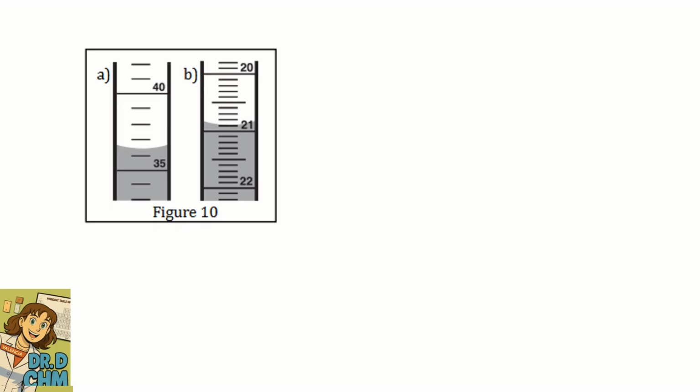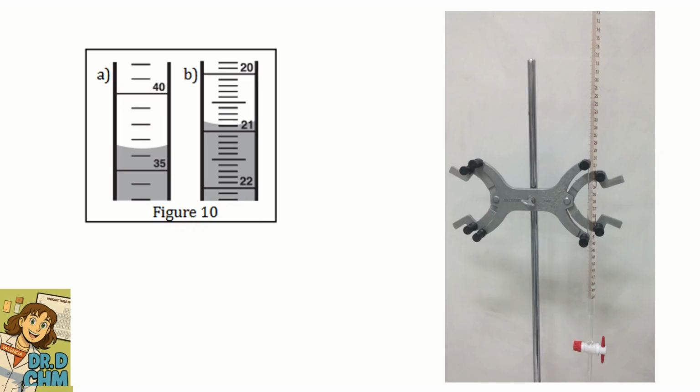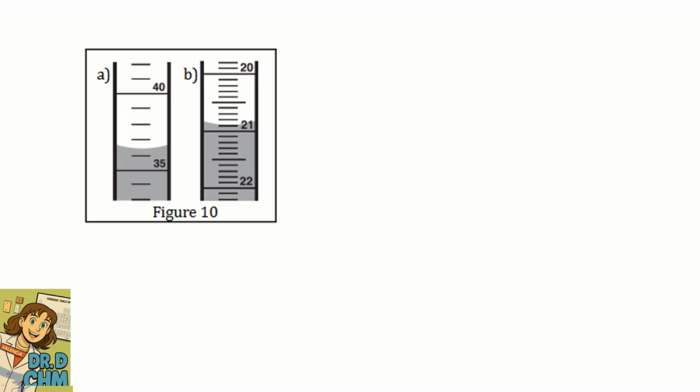First, let's look at this first one, A. Let me just grab a pen. Okay, so let's look at the A over here. This is pretty easy, but you need to pay attention to how to read it.